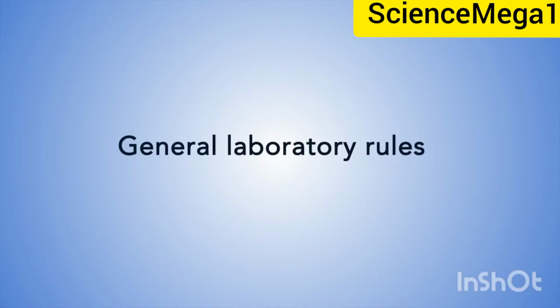Safety in the laboratory is important in preventing accidents, fire, explosion or diseases. To ensure a safe, secure and healthy environment for you, your teacher and other students to carry out investigations, basic safety laboratory rules and procedures must be adhered to. And these are general laboratory rules.